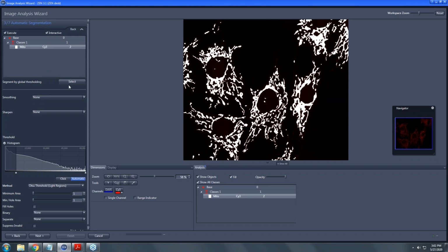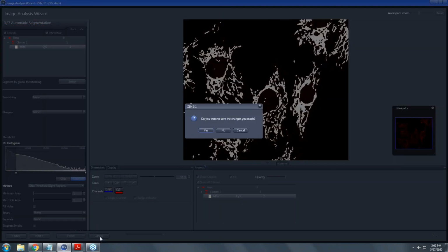And because we have a really nice high contrast image, it's not having any problems identifying the mitochondria. So we can cancel out of this, Nicole. I think probably everybody's convinced that we can take a beautiful image and identify mitochondria. That's not a problem.